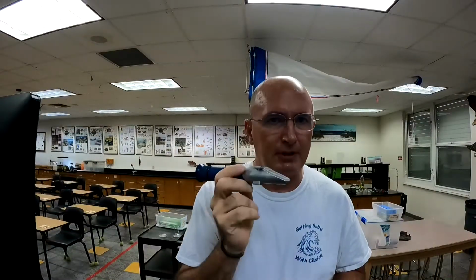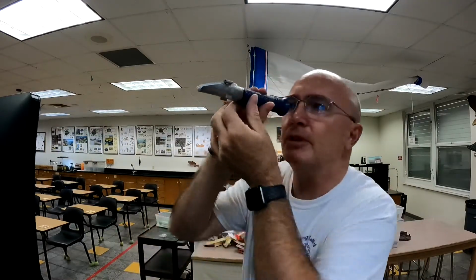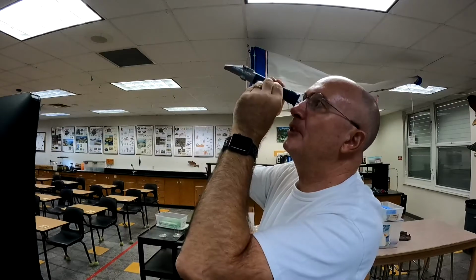The third method for determining salinity uses the refractometer, this device right here. It measures how much light is bent as light passes through the water. So we take our pipette, put it into our container of our sample of water, add 2 or 3 drops right there, close this, hold this up to the light, and look through the eyepiece. You can see the top half is blue, the bottom half is white. Where the blue and white meet, that line, look on the scale, and you can record the salinity.